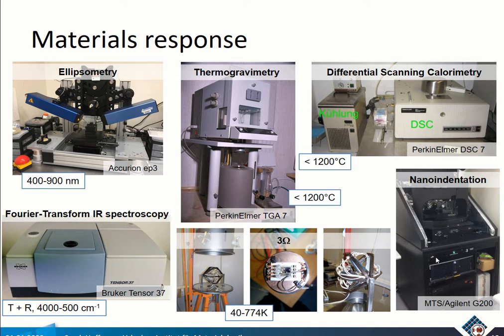For the mechanical properties, we have different indentation systems ranging from the nanoscale to the micron scale. We have here a self-constructed 3 omega measurement system, that is to estimate the conductivity of your thin films.